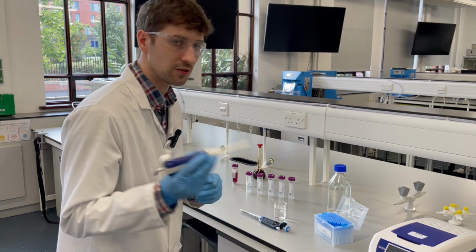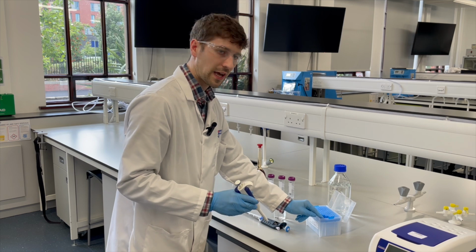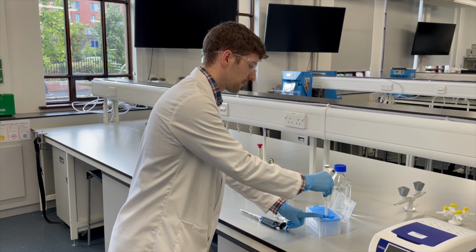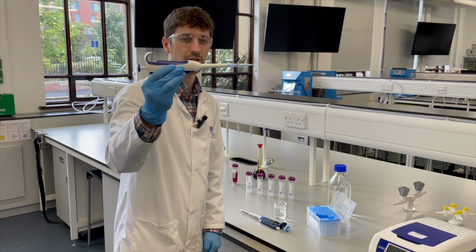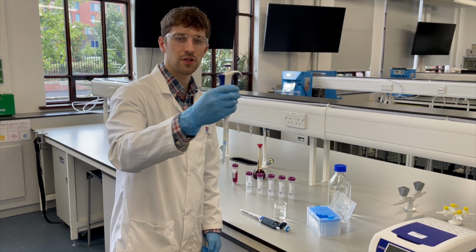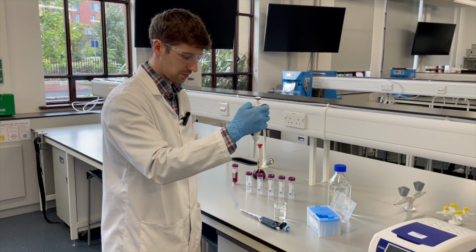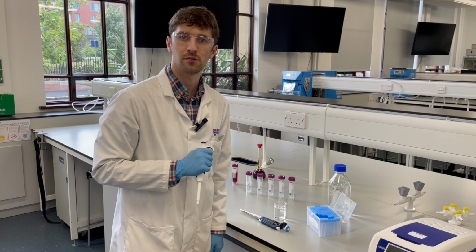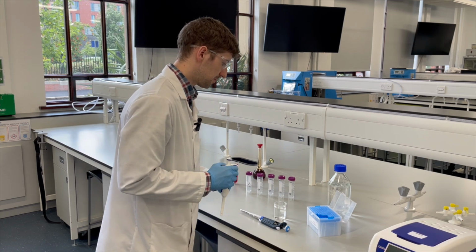And the easy way to load a pipette tip onto your pipette is you just take a blue tip box, push the pipette into the tip box and remove it, and you've got your nice pipette tip on top. To eject the pipette tip, there's a second button here on the side, this lever, and you just press it, and the pipette tip will go directly into our bin, like this yellow bin I have here beside me.